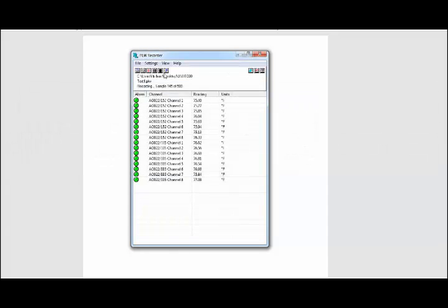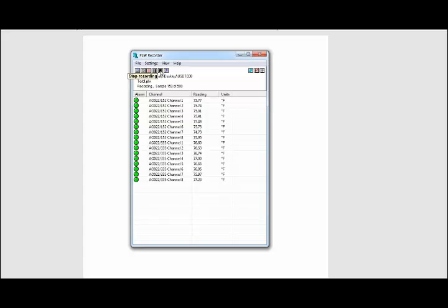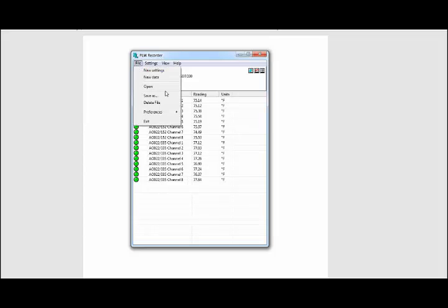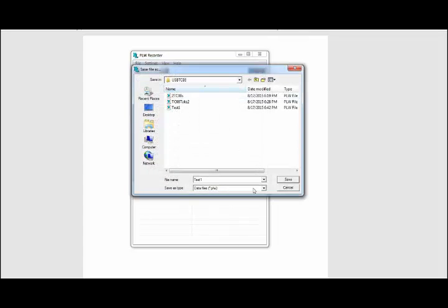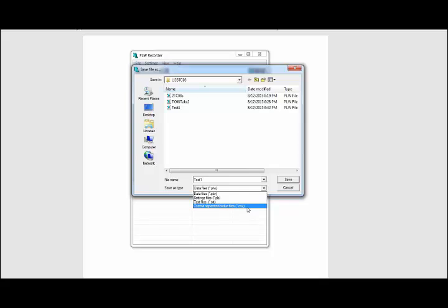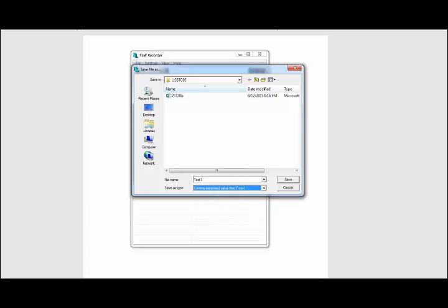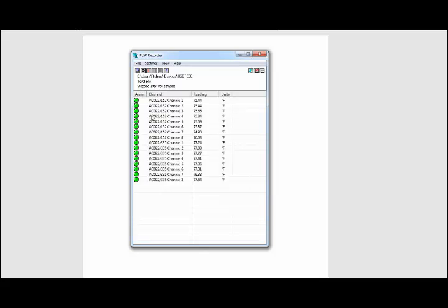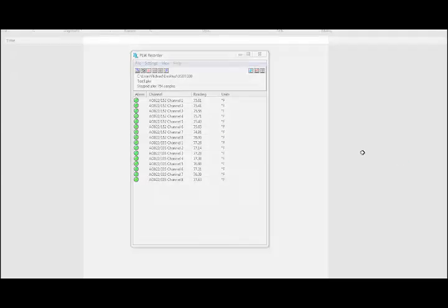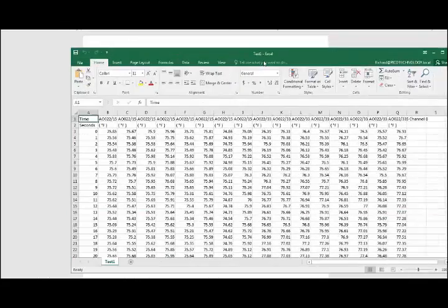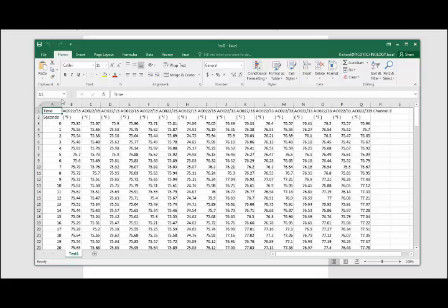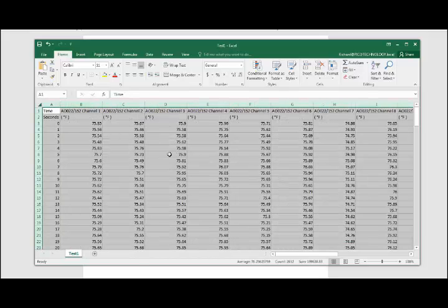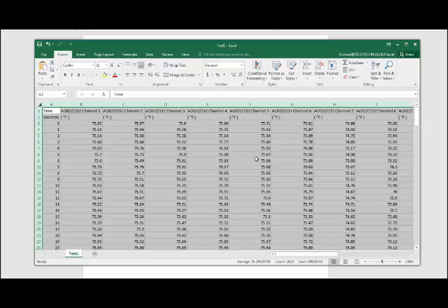Now after everything is done and logged, we can hit the stop button or you can wait for it to automatically stop after your chosen time frame. Everything is now saved to wherever you put this PLW file. Now if I want to open all 16 channels in Excel, I can go to File, Save As, and change the save as type to CSV. Now if I bring up that Excel file, you'll see it will have the time and then all the temperature readings from all 16 channels displayed, so you can make graphs and manipulate the data however you want to.